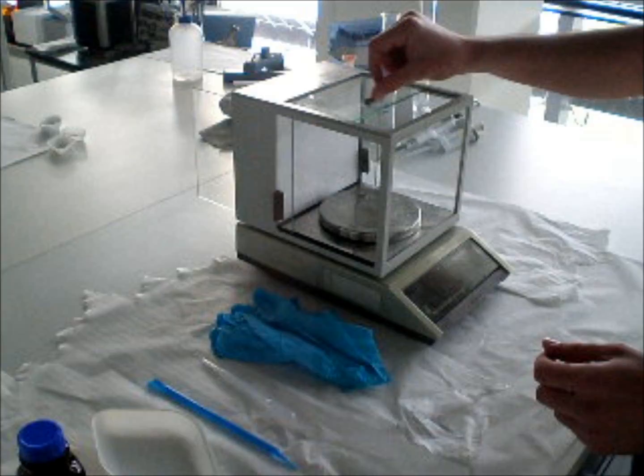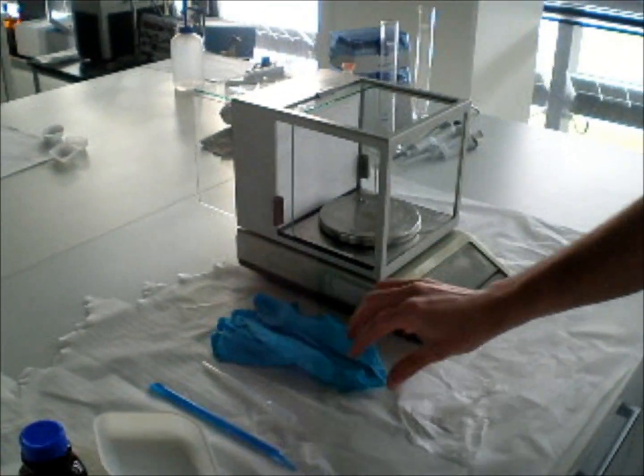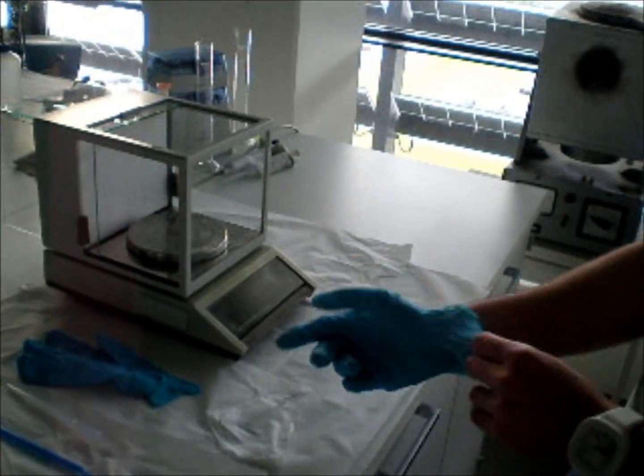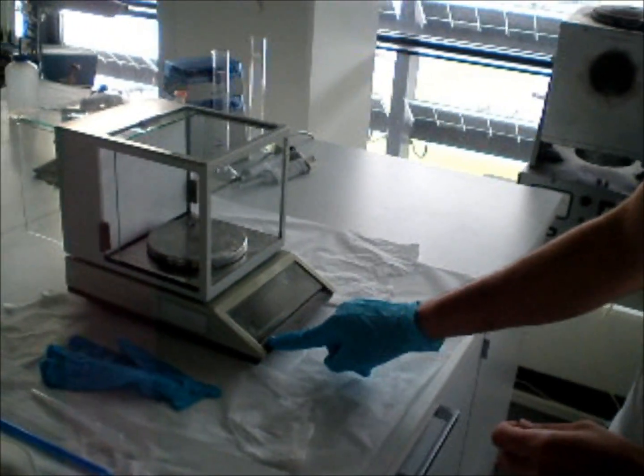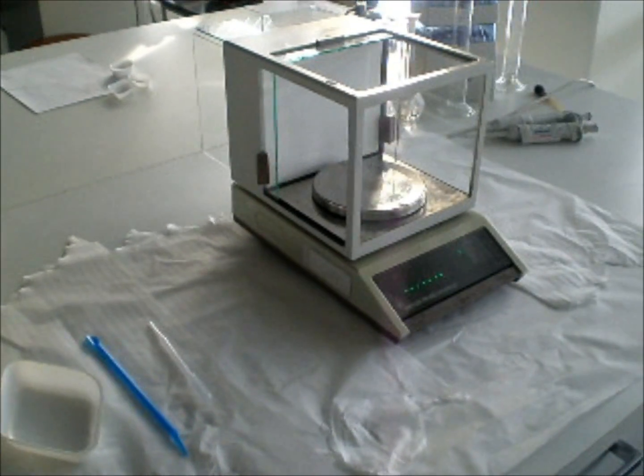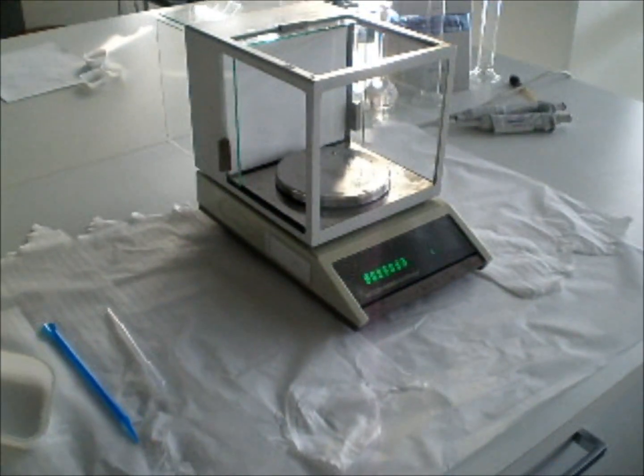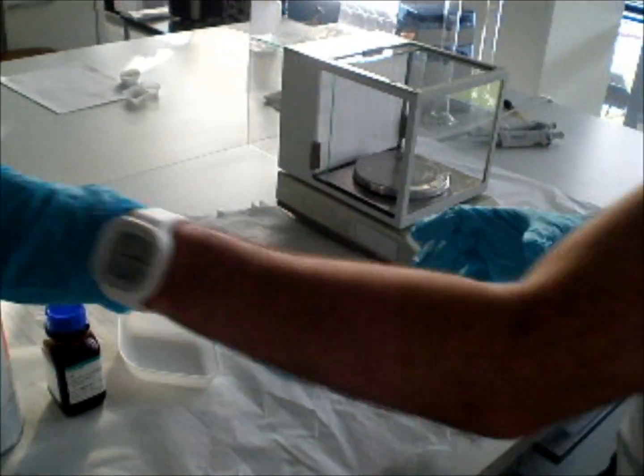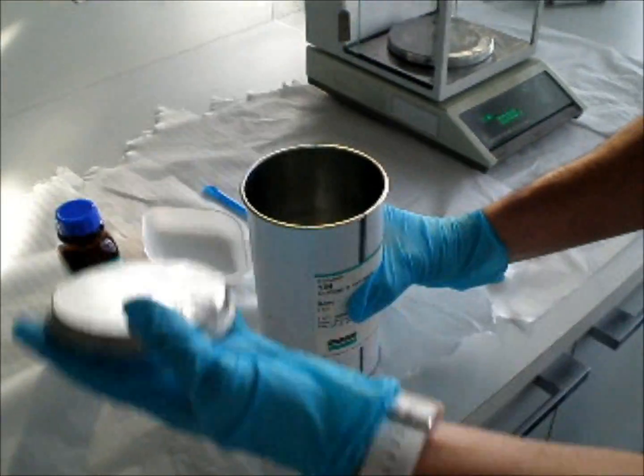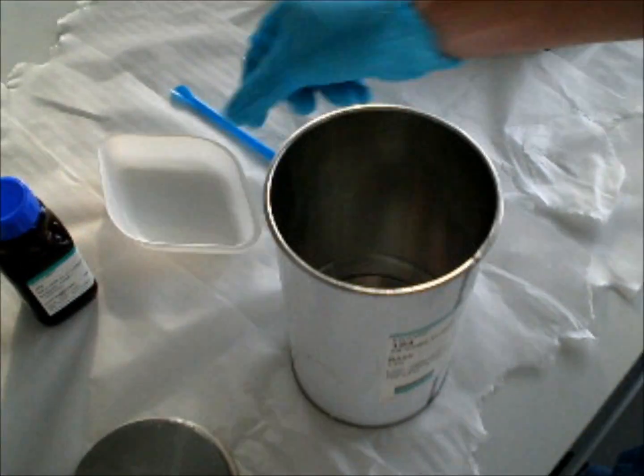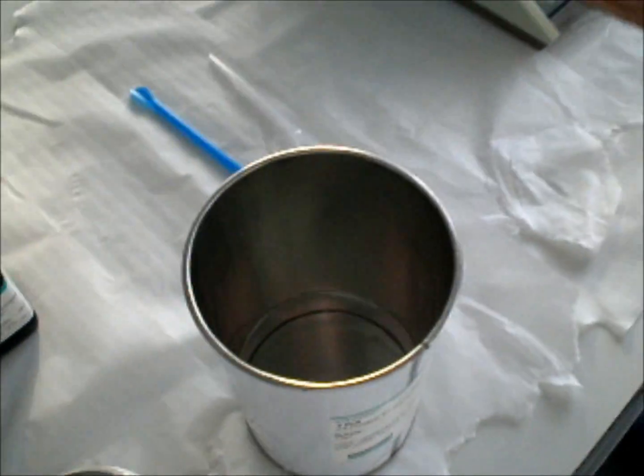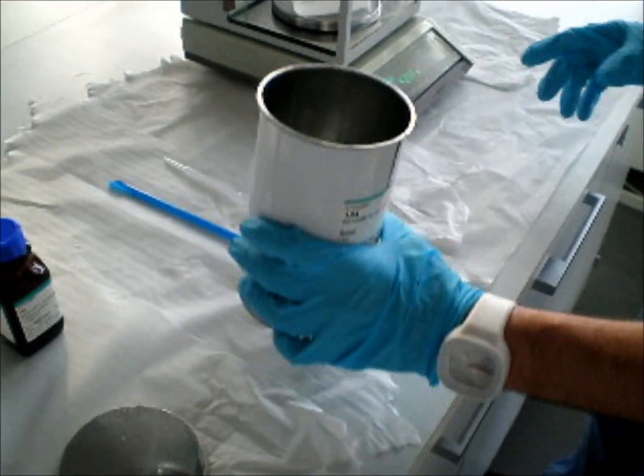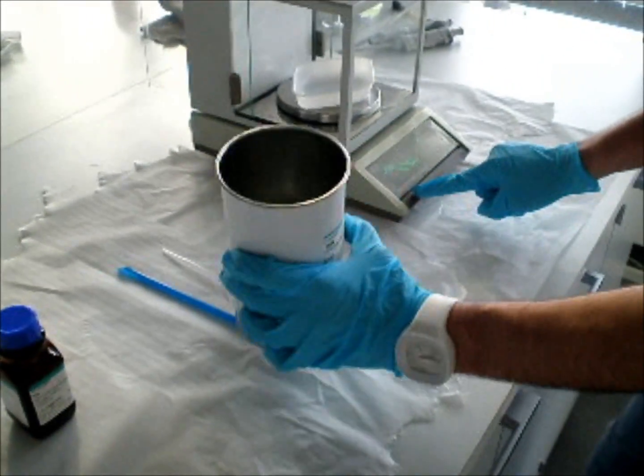We have here the gram meter. We start it on and put our gloves. Ok. So, we have the silicone. We open it, put it inside. There is nothing inside, so we make it zero.